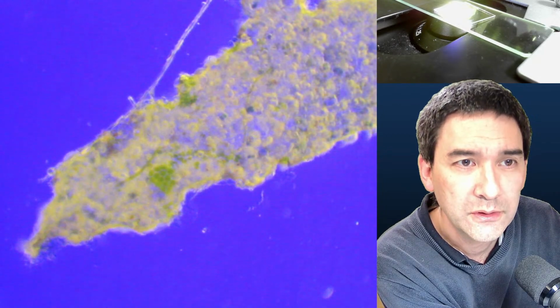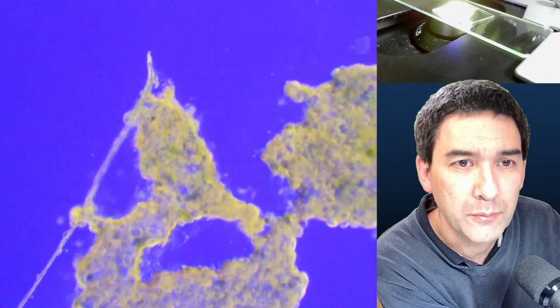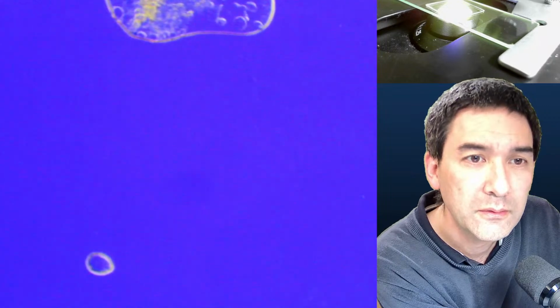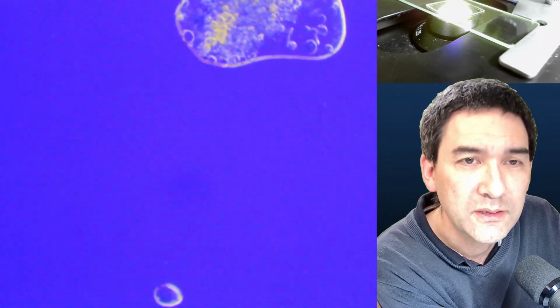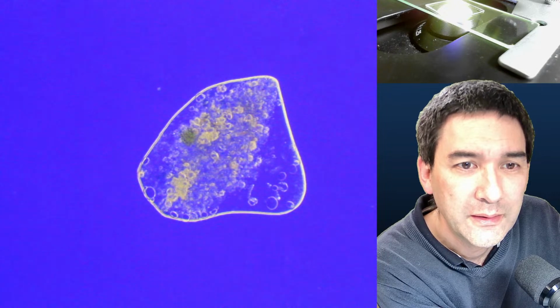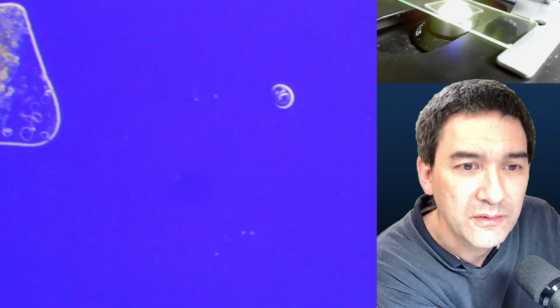Okay, it's not blue, but I have to tell you, I prepared this last hour, so it could be that it's all dried up already. There were some water microbes and some rotifers in here. But see, it's already all dried up. I think I have to prepare a new specimen. There's some remaining algae and so on. There is stuff moving in here, but it's too small to see.